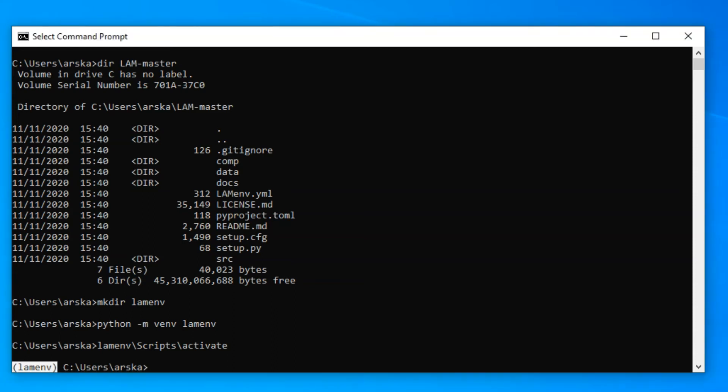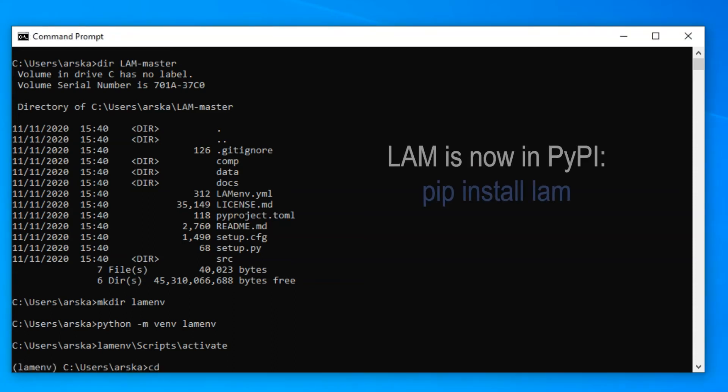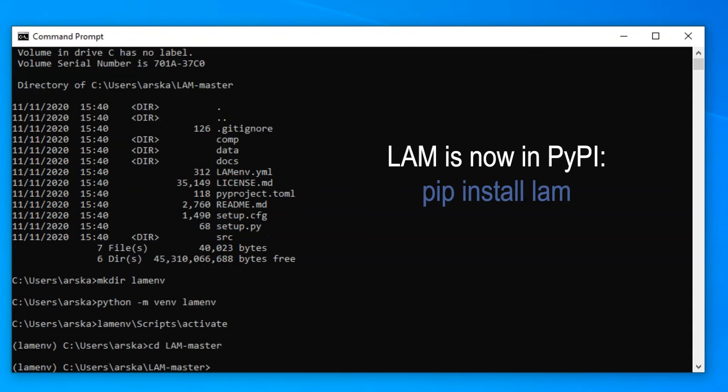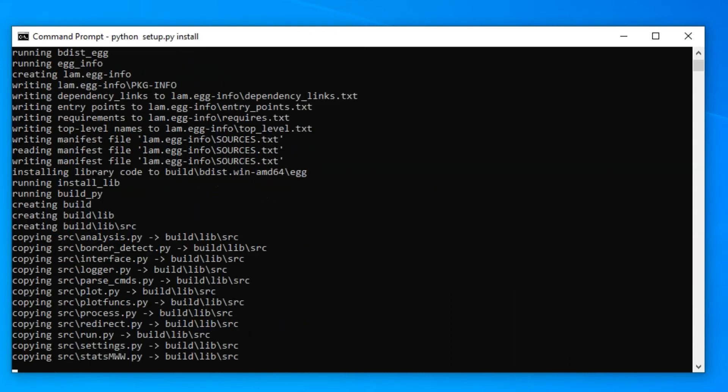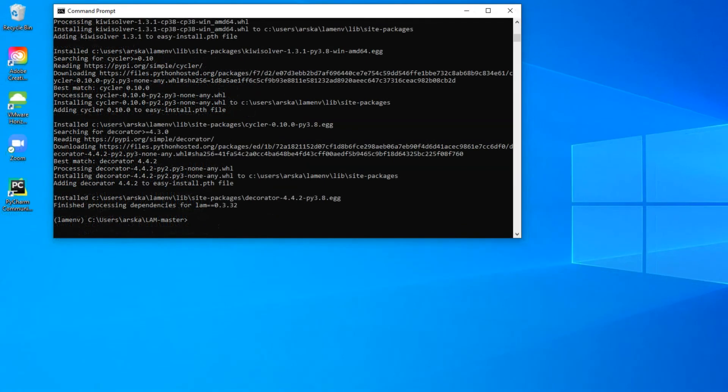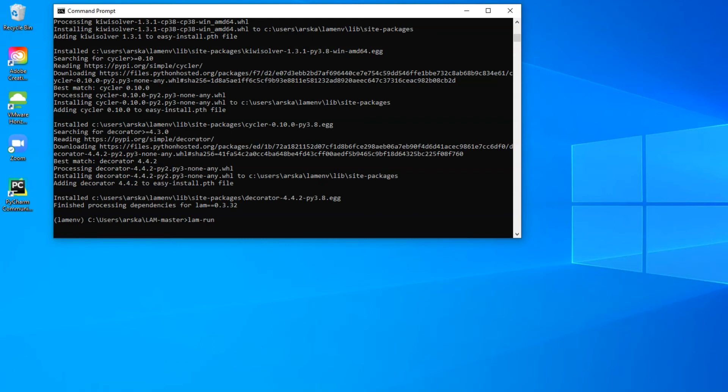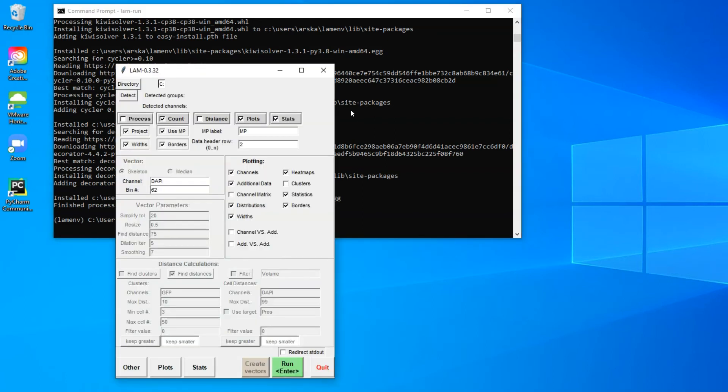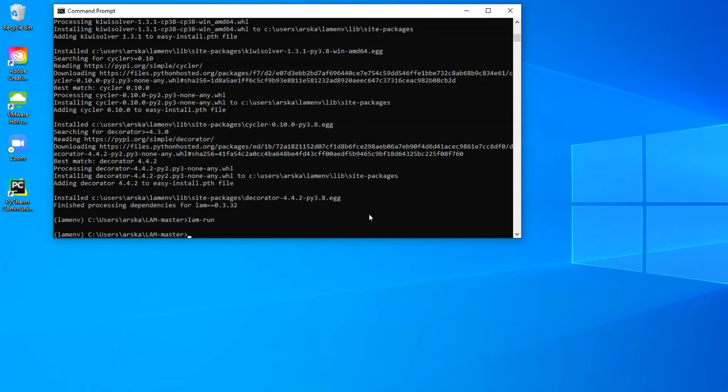Installing LAM is then as simple as typing python setup.py install, while located in the LAM master folder. After everything is installed, you can run LAM when your environment is active by typing LAM run or alternatively by giving Python the command to execute run.py in the LAM's SRC folder.